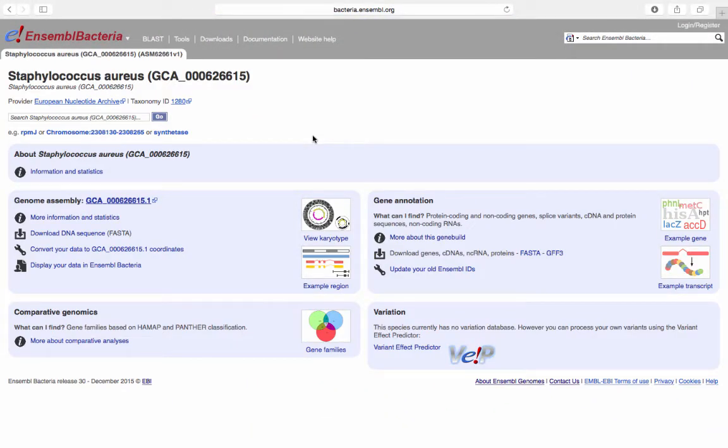Clicking on the species name has taken us to the species-specific homepage, where we can search for particular genes or genomic locations within the bacterial species.